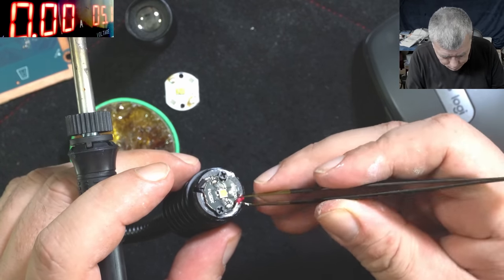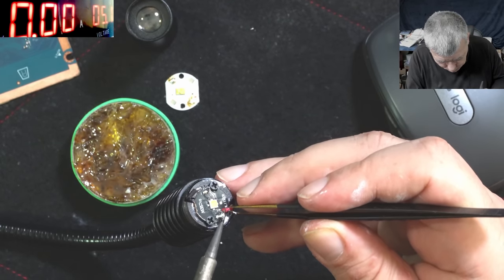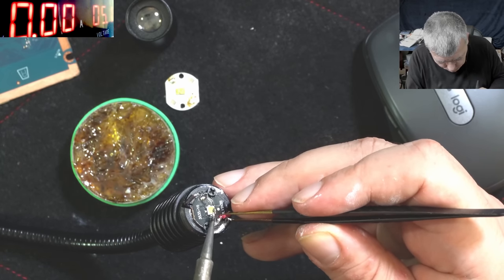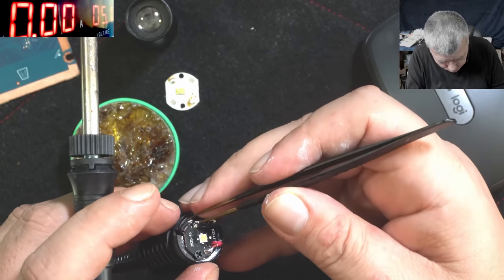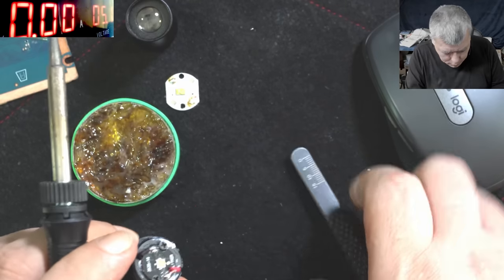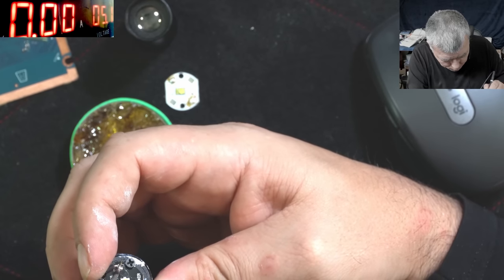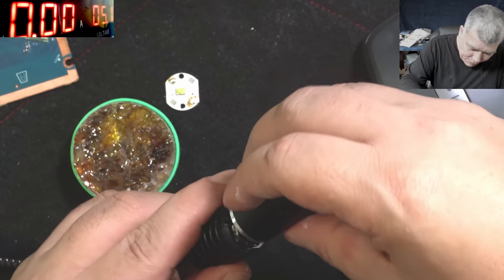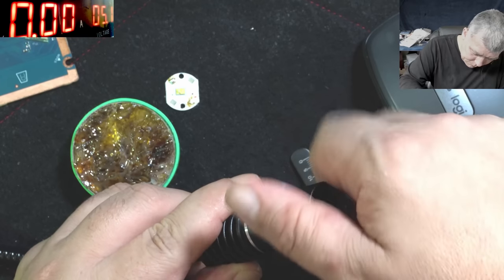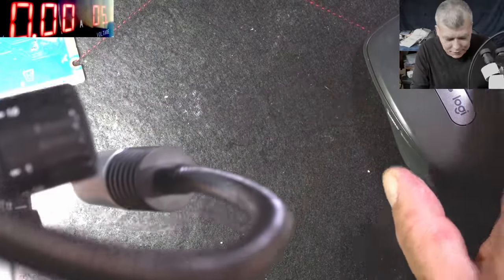Now we have the plus sorted. We have the plus connected. Perfect, all done. Now let's put this back. All done — so now both are installed here. Let's have a look together.